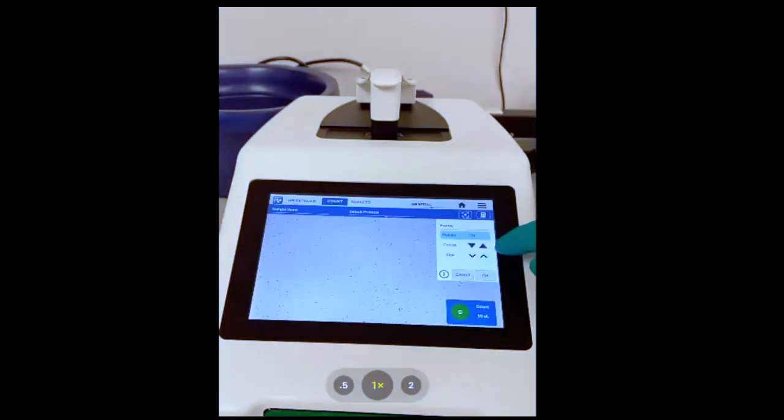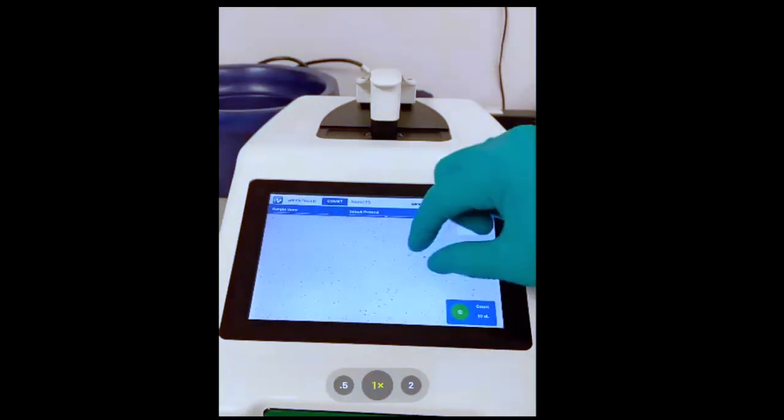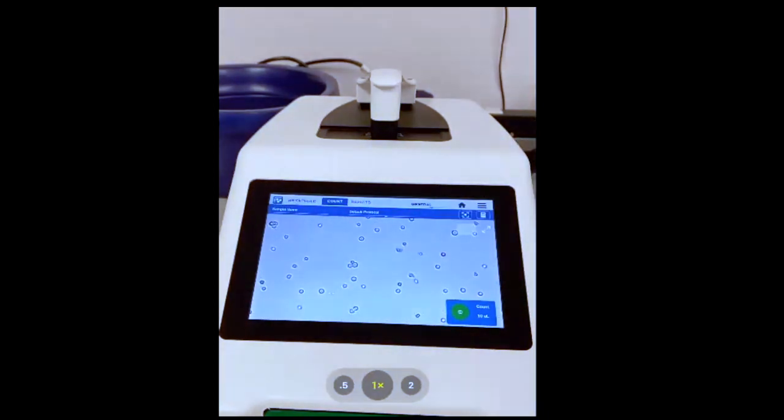Yeah, for the most part, excluding the last one that I went over, which was the different settings and parameters on an automated cell counter. The rest of the tips that we discussed here would all apply to counting with the manual hemocytometer.